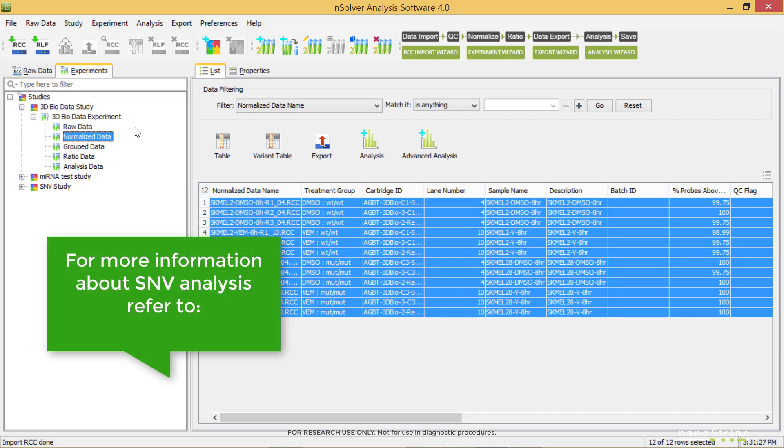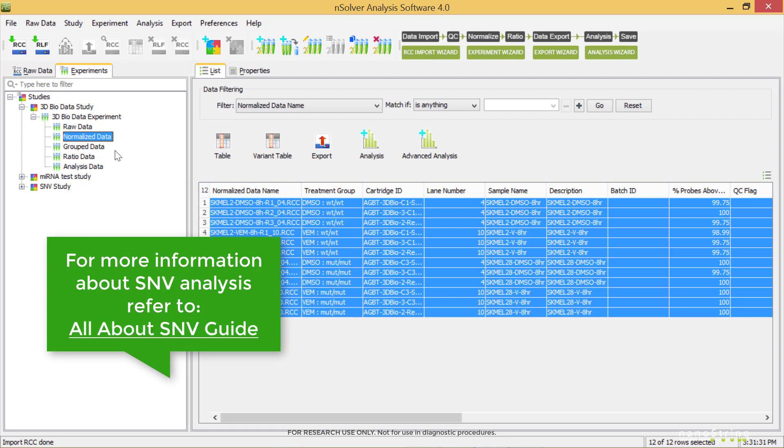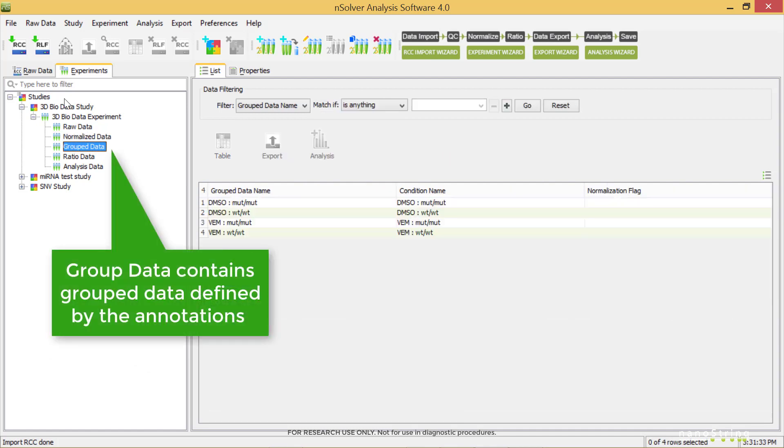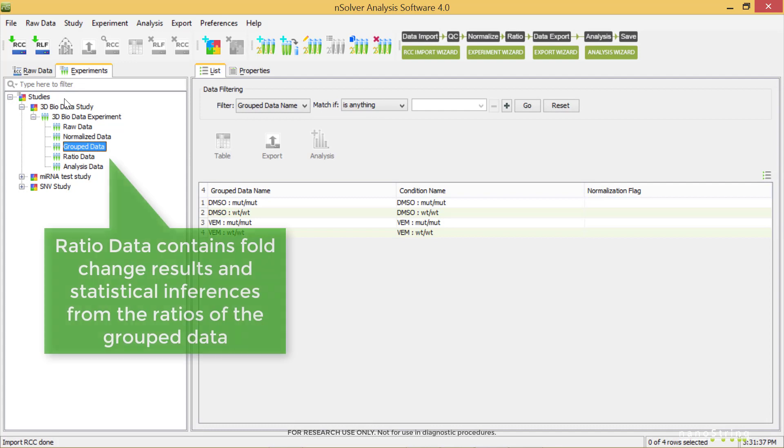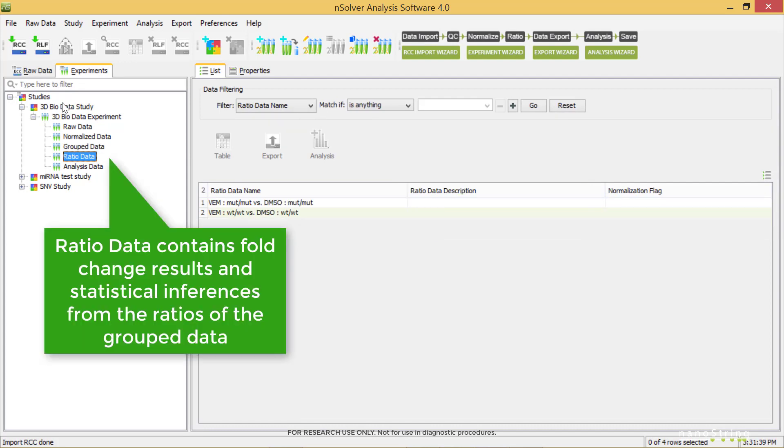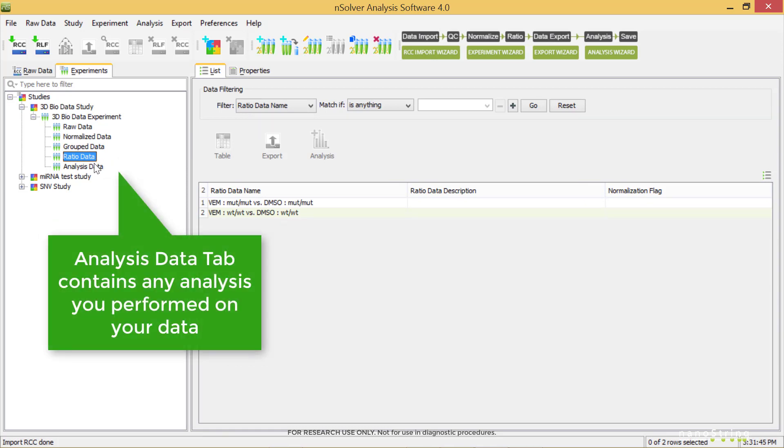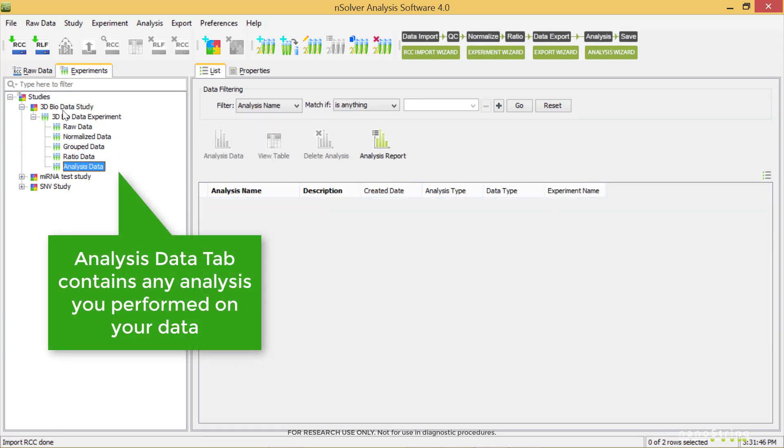For more information on SNV analysis, you'll want to refer to the NSOLVER Manual or the All About SNV Guide. The grouped data contains groups as defined by the annotations created earlier. And the ratio data contains full change results and statistical inferences from the ratios created by those groups. The analysis level will have any analysis that you may have performed on this data.